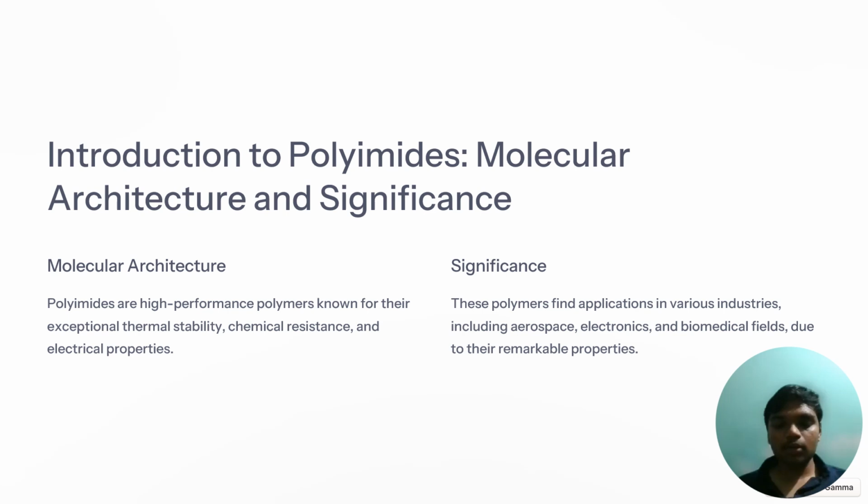First, we'll talk about the introduction of X-ray crystallography. X-ray crystallography is a powerful technique used to determine the atomic and molecular structure of crystals by shining X-rays onto a crystal and analyzing the pattern of diffracted rays. Scientists can determine the arrangement of atoms within the crystal structure.